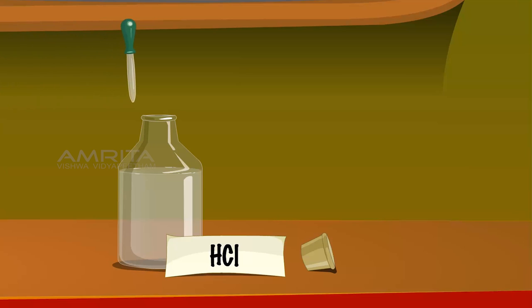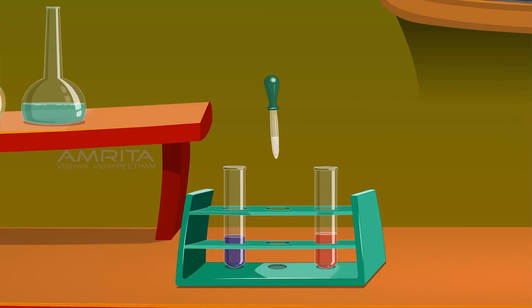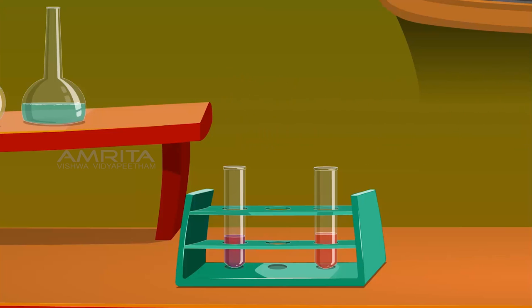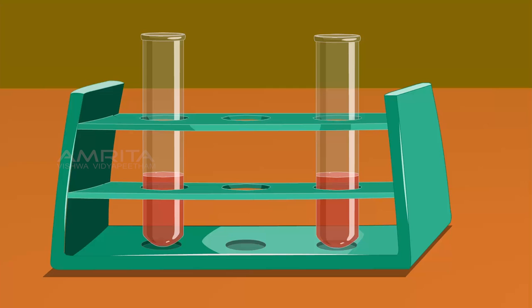Take a few drops of HCl solution from its bottle using the dropper. Add this to the test tube containing the blue litmus solution and note the change in colour. The colour of the solution changes from blue to red. HCl is an acid with a pH value below 7.